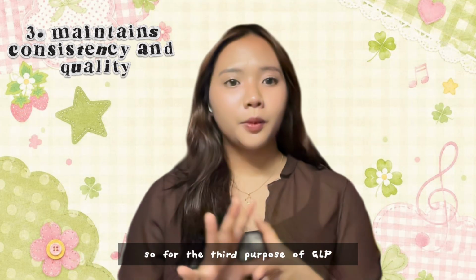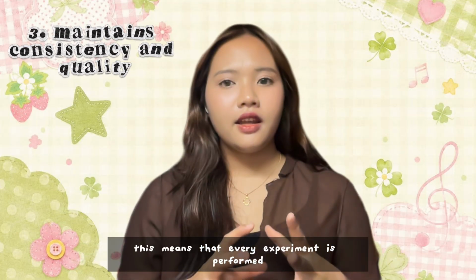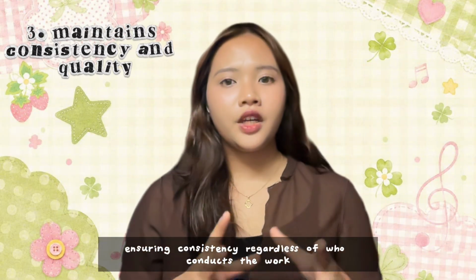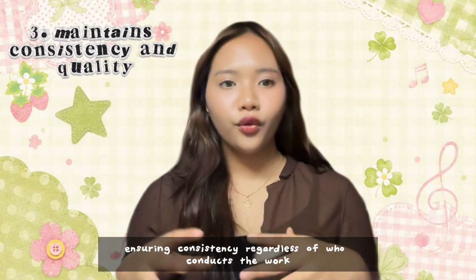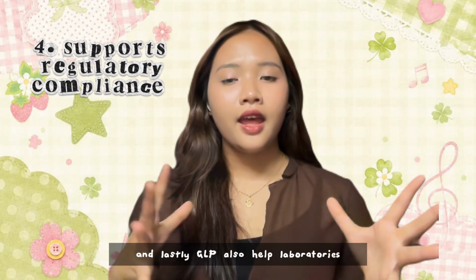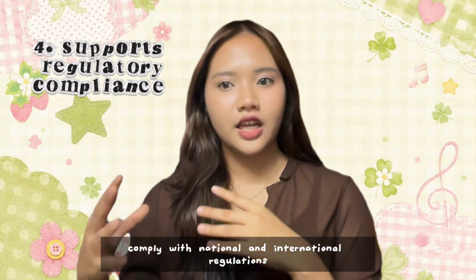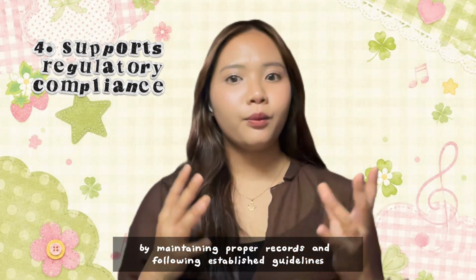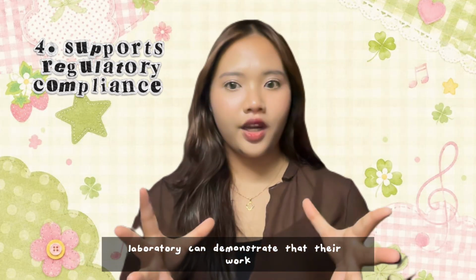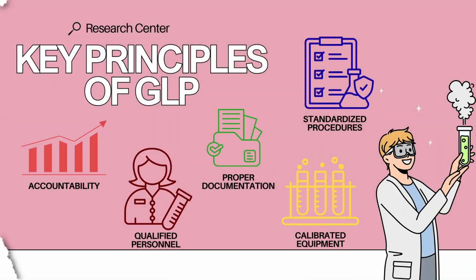The third purpose of GLP is to standardize the laboratory procedures. This means that every experiment is performed using the same approved method, ensuring consistency regardless of who conducts the work. And lastly, GLP also helps laboratories comply with national and international regulations by maintaining proper records and following established guidelines. Laboratories can demonstrate that their work meets the required quality standards.